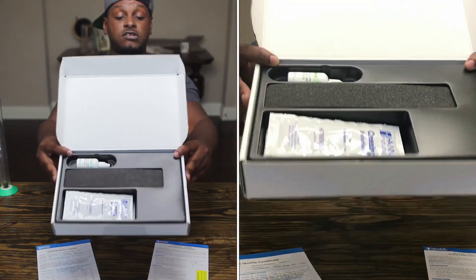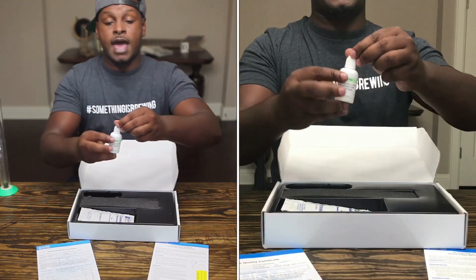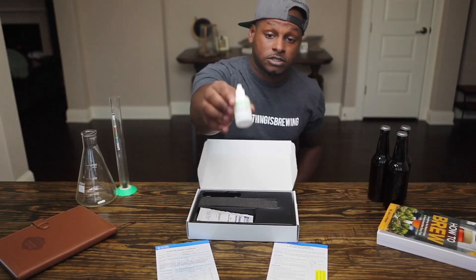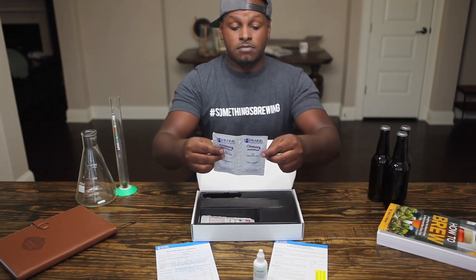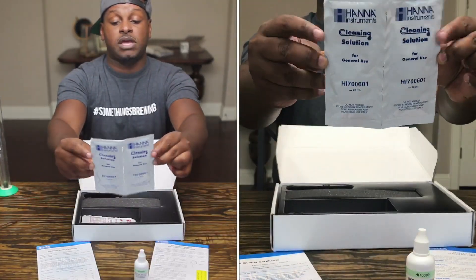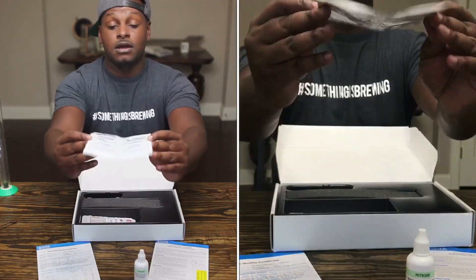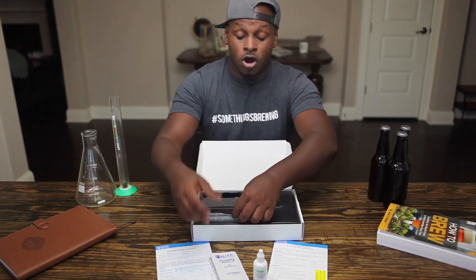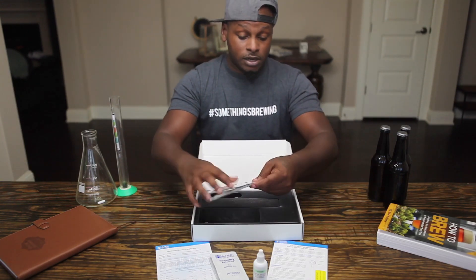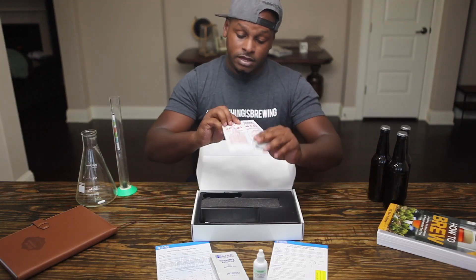Here's the packaging on the inside. It comes with some storage solution, which is always a good thing with high-end pH meters because you definitely don't want your electrode to dry out and become useless. It also comes with cleaning solutions so you can keep that electrode and the pH meter clean at all times. I'm not the type to clean brewing equipment with Dawn or any other soap — I usually use PBW or OxyClean Free — but having dedicated cleaning solution is a nice touch.